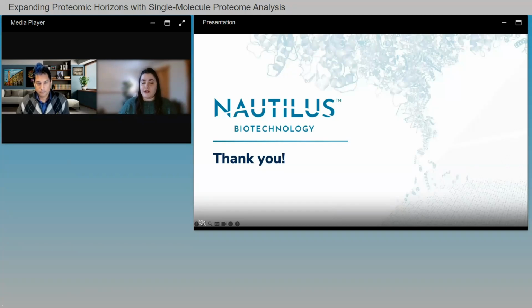Our first question asks, can the targeted proteoform mode accommodate targets other than tau?